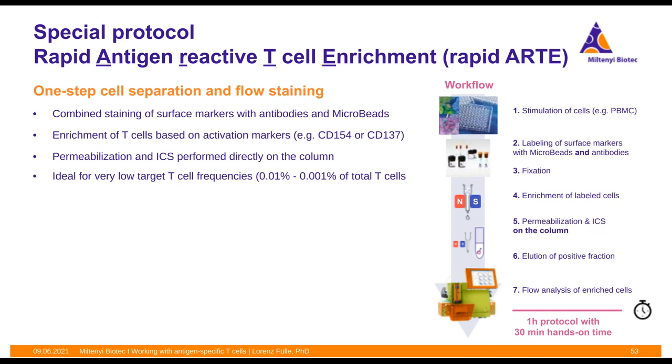So next, I would like to quickly introduce the so-called Rapid ARTE protocol, which stands for Rapid Antigen-Reactive T-Cell Enrichment. And Rapid ARTE is actually, I think, the perfect solution for the analysis of rare antigen-specific T cells, as it combines cell stimulation, surface marker staining, intracellular cytokine staining, and an enrichment step based on T cell activation markers, such as, for example, CD154 or CD137.